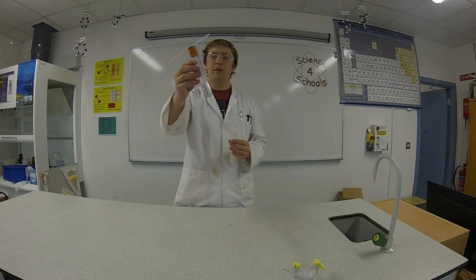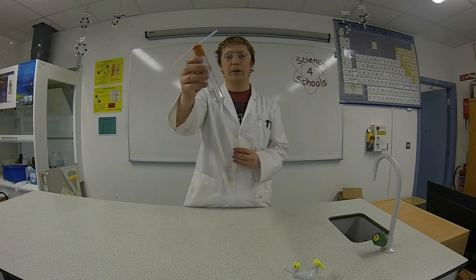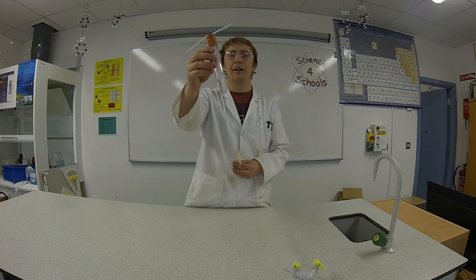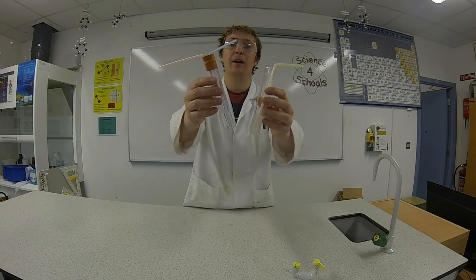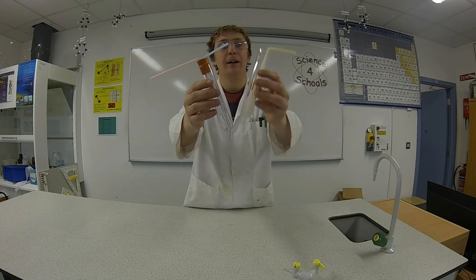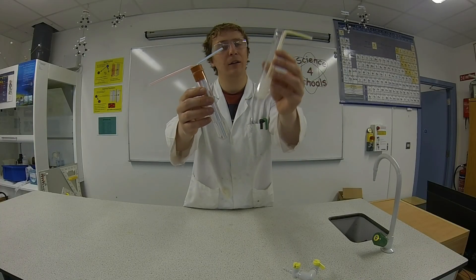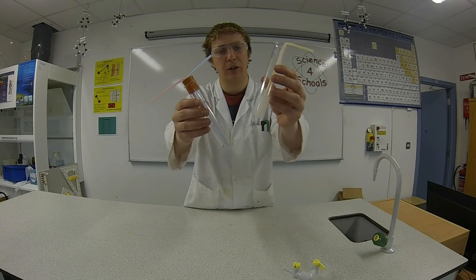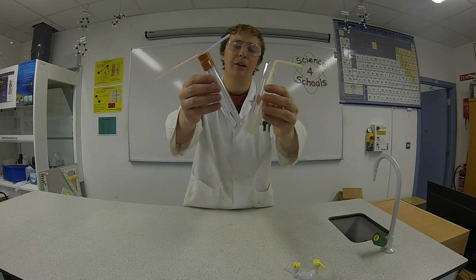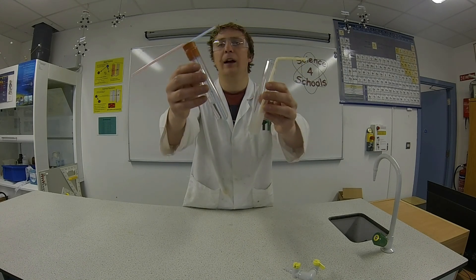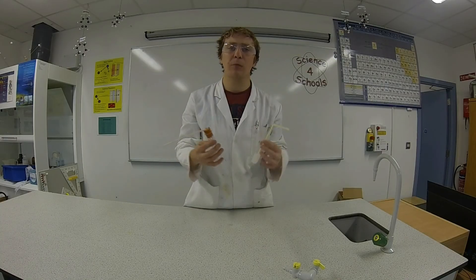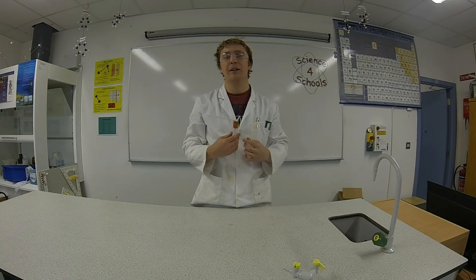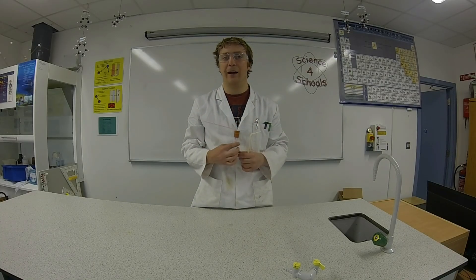You can see the lime water there has stayed a clear colour. So comparing the two: the exhaled air turned the lime water milky, while the inhaled air kept it clear. That shows that there's more carbon dioxide in exhaled air than in inhaled air.